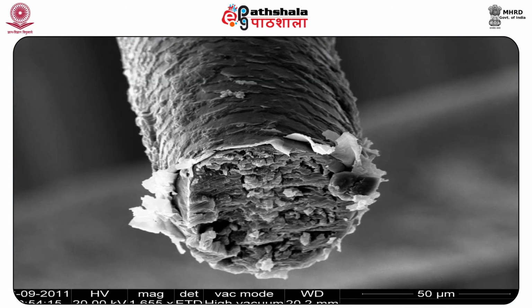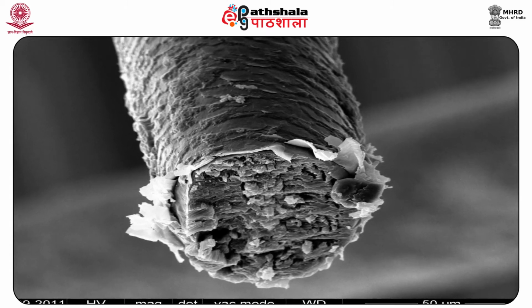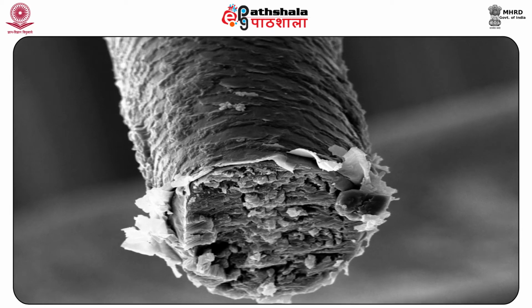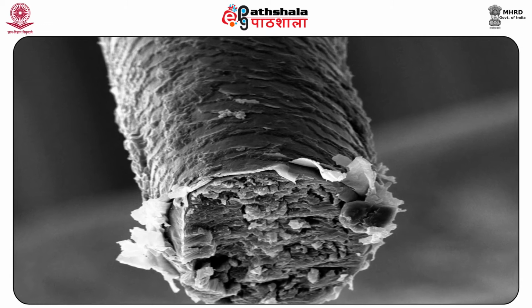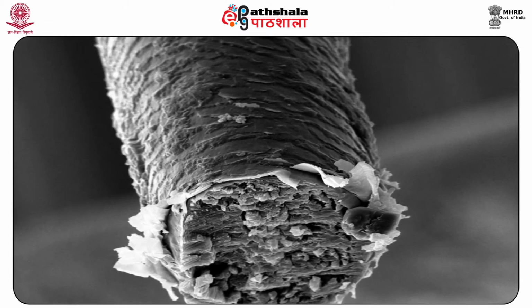The pulled out hairs have live bulbs and signs of stretching near the bulb, while the fallen hairs have roots that are frayed and shrunken. The detailed microscopic examination of hairs is done after cleaning them in an alcohol ether mixture or acetone. They are then mounted in Canada balsam on a microscopic slide and examined with a magnification of about 400x.